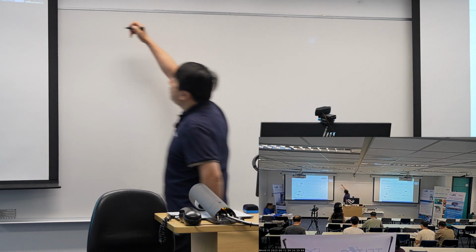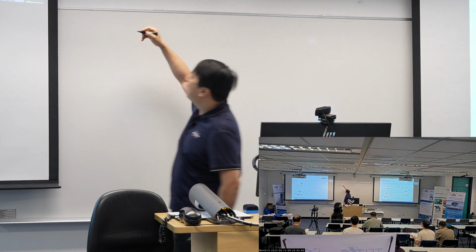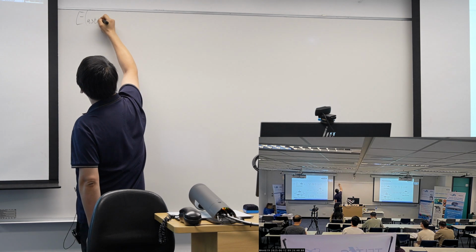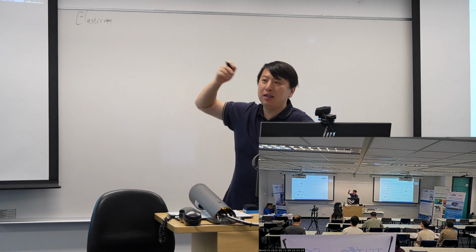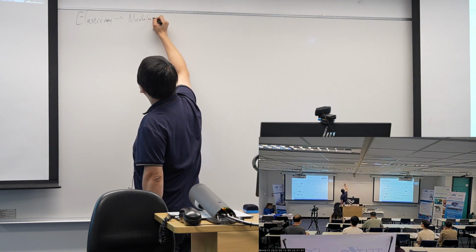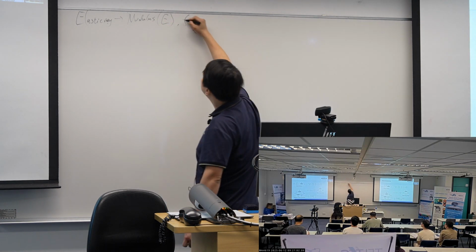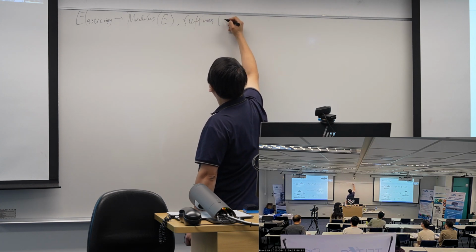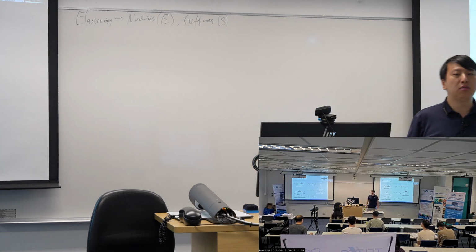So basically, viscoelasticity starts from elasticity. The main parameter to describe elasticity is the modulus, and we use the letter E, and sometimes stiffness, and we use S. They describe the elasticity of the samples.